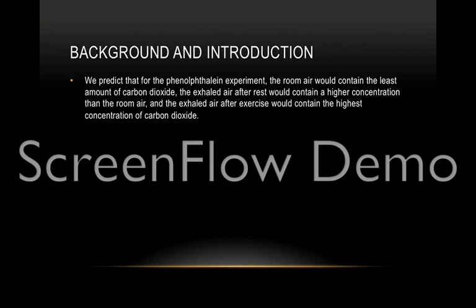Our hypothesis is that the room air would contain the lowest amount of carbon dioxide, the exhaled air after rest would contain a higher amount, and the exhaled air after exercise would contain the highest amount of carbon dioxide.